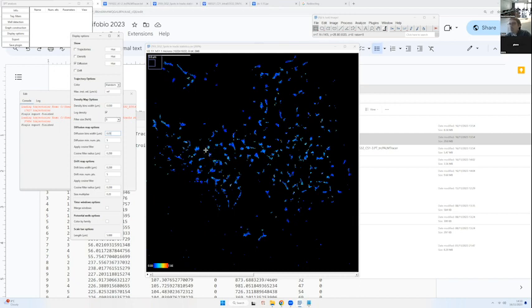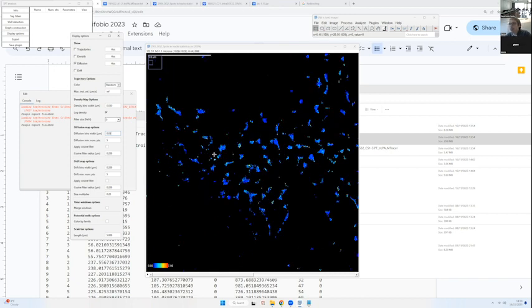So in order to have reasonable values, we want to remove the bins where there are not enough points. For that, we have this other option called diffusion min num PTS. This is 5, so it will remove all the bins with less than 5 points, where the average is computed on less than 5 points.